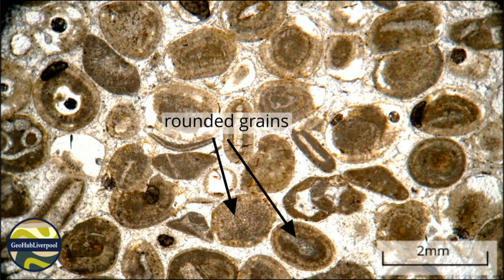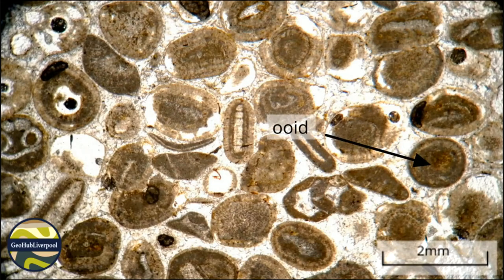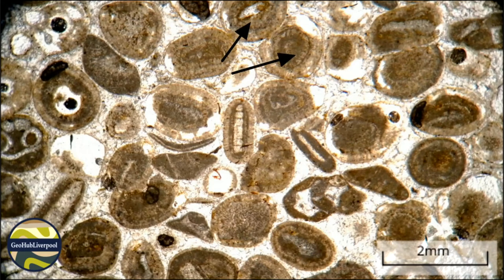These spherical non-skeletal grains are called ooids and they are mainly composed of carbonate mud or micrite. They have a light brown colour under plain polarised light.